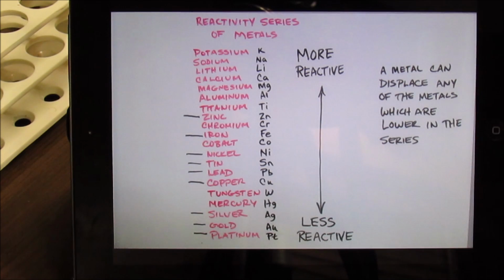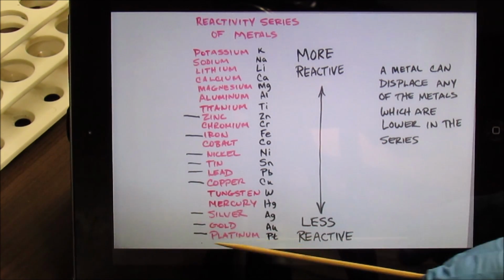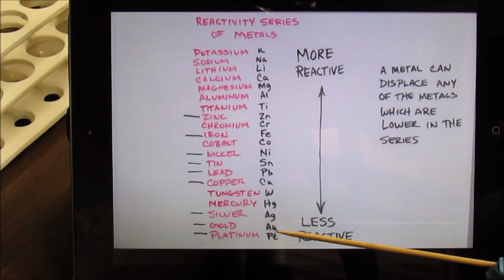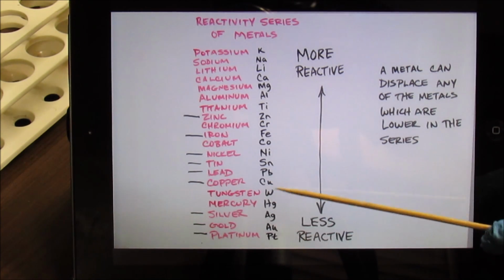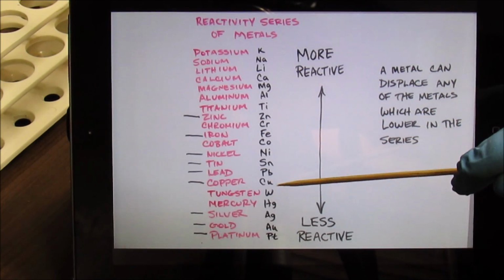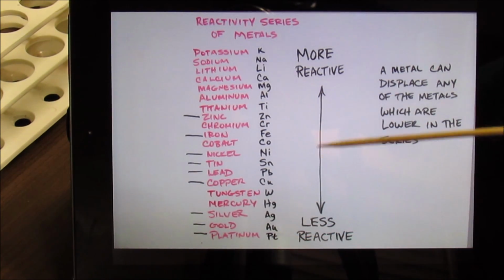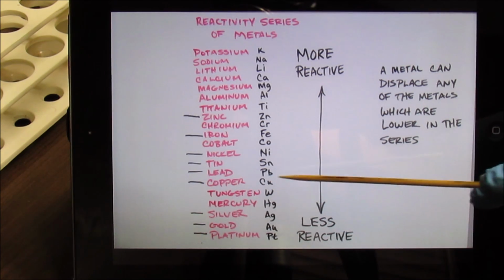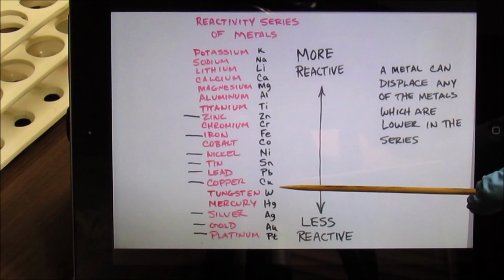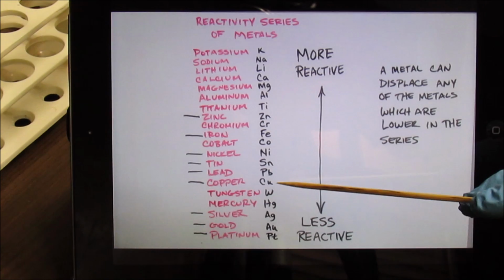Okay, here's a list of the reactivity series of metals, and based on the tests out there, I've got some platinum, some palladium that's not shown on here, but it'll be down here with the platinum. I've got platinum, palladium, and copper in solution. So what I'm thinking is use copper to cement out the platinum and palladium. But that's not a good way to go, I don't believe, because copper's way down the list down here. It's not very reactive, and it would take a long time to cement those metals out. That's the same thing that would be happening there as what happens in my stock pot.